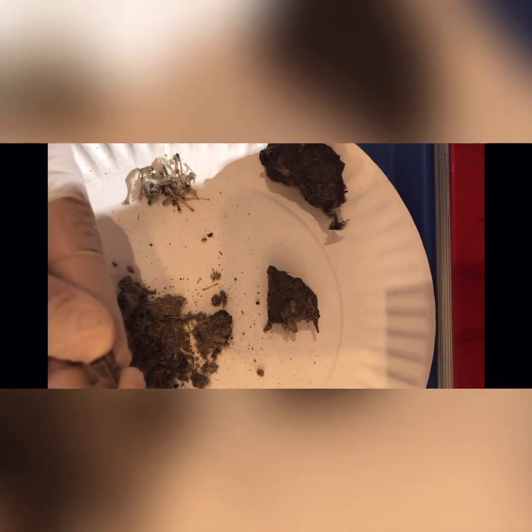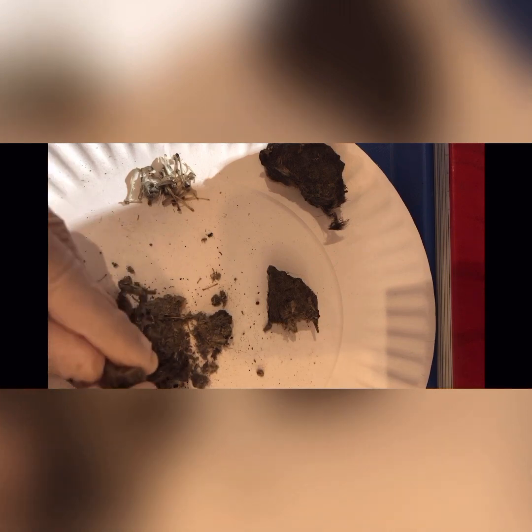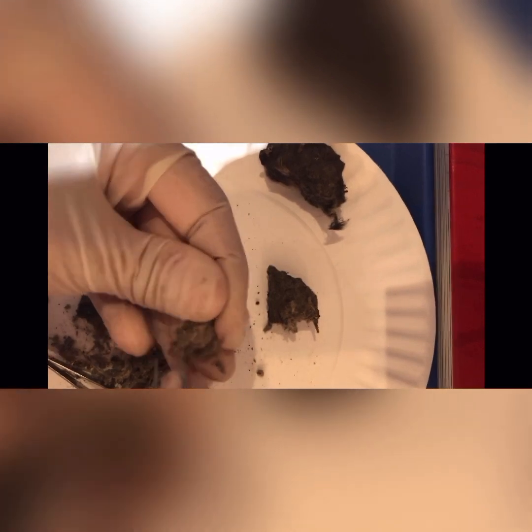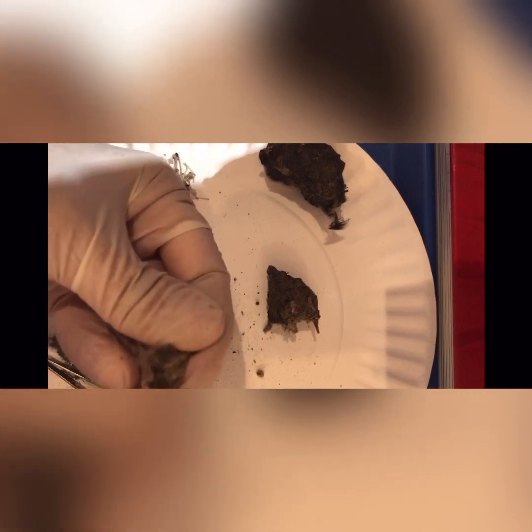Still looking. What I really am looking for is the skull, and I don't know what this is. It's another jaw or a skull. Sometimes they get wrapped in together. It just takes a little bit of precision to carefully take out all the fur that's in here. I have a little bit of water that I could use to wash them off too, but I'm not gonna do that just yet.